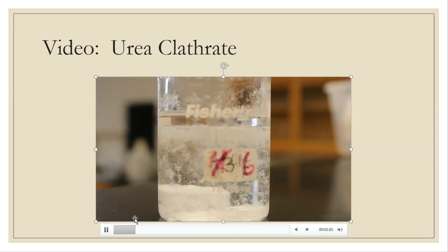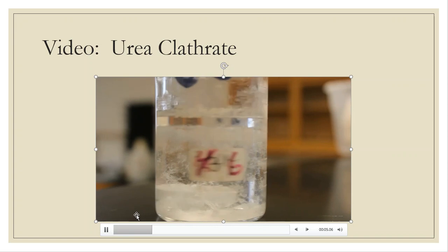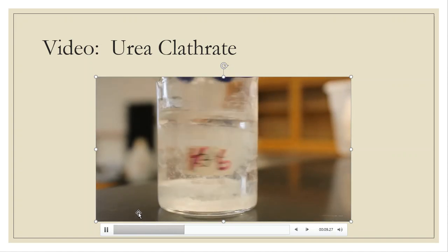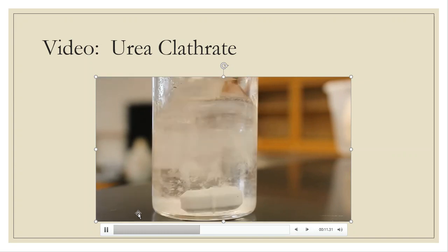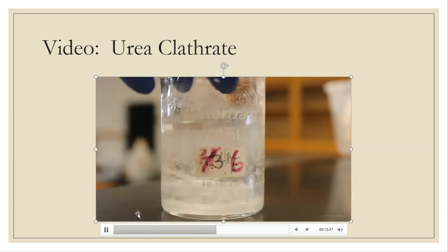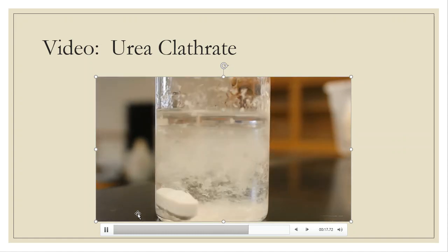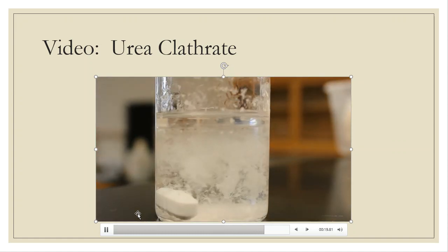So this is my alkane mix with the methanol and urea. After a few minutes, 5 minutes or so, this is what I'm seeing in the beaker. That way you can make your observations as you see fit. But that is what this process begins to look like, quite different from what it did in the very beginning.